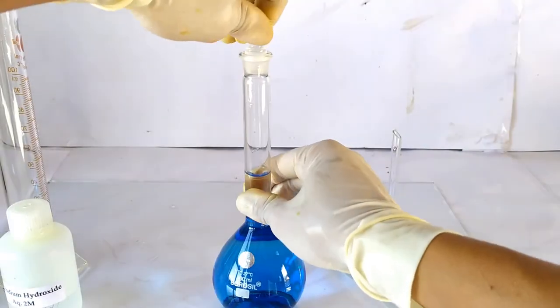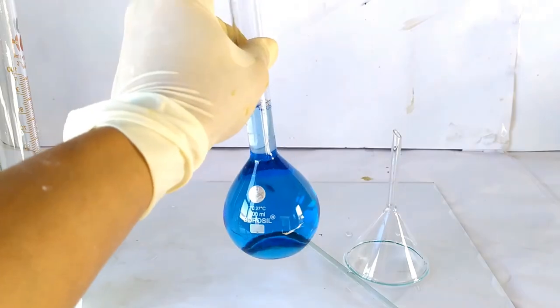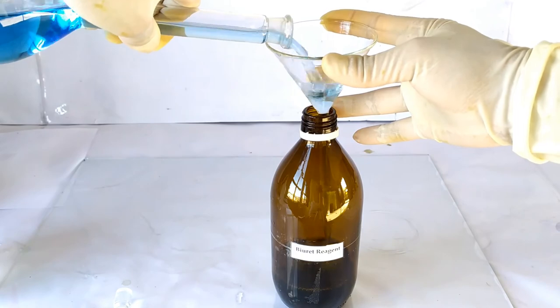Stopper the flask and invert it several times to homogenize the solution. Transfer the prepared reagent into a suitable labeled container.